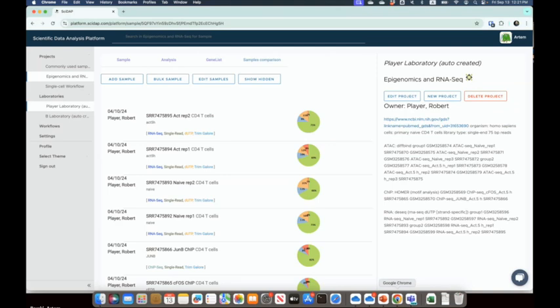And so they have a very detailed standard description, and I think this helps its use. And as a standard, it is maintained by a group of developers combining both industry and academic people. WDL is Broad only, and Nextflow is some commercial company somewhere in Europe.